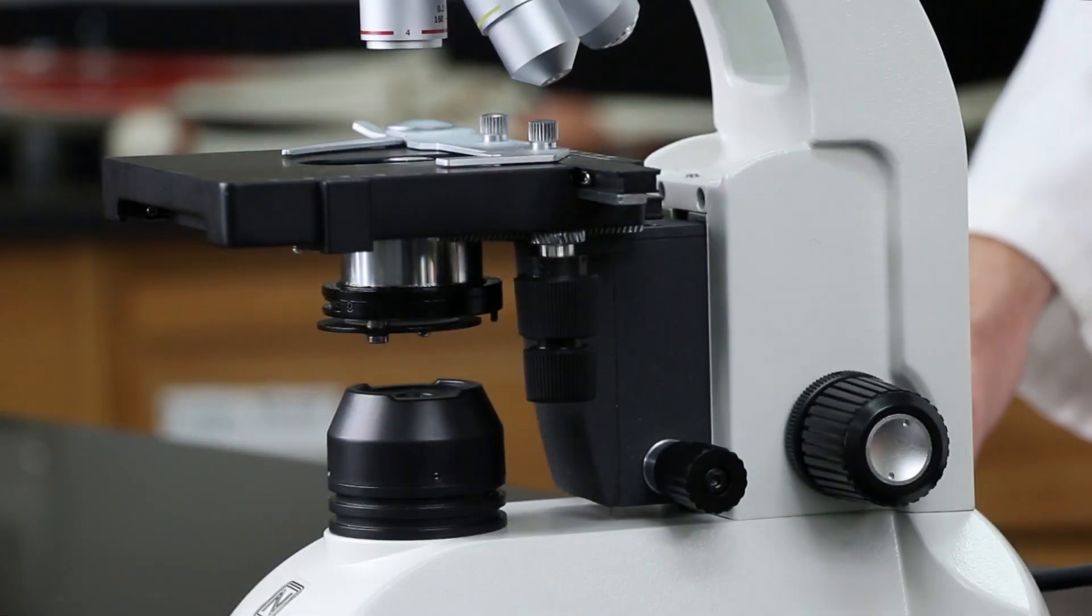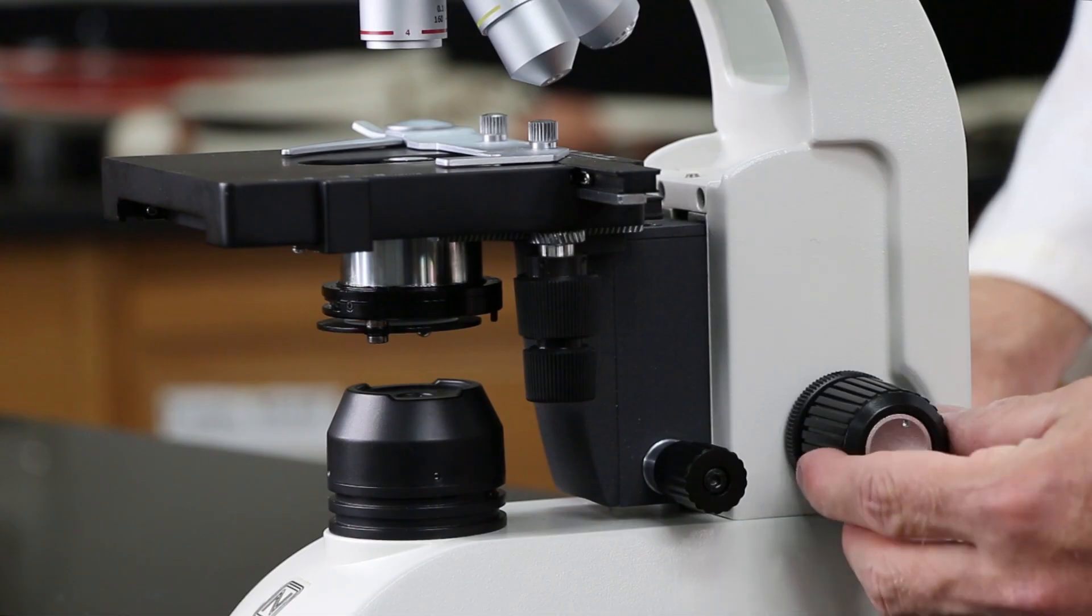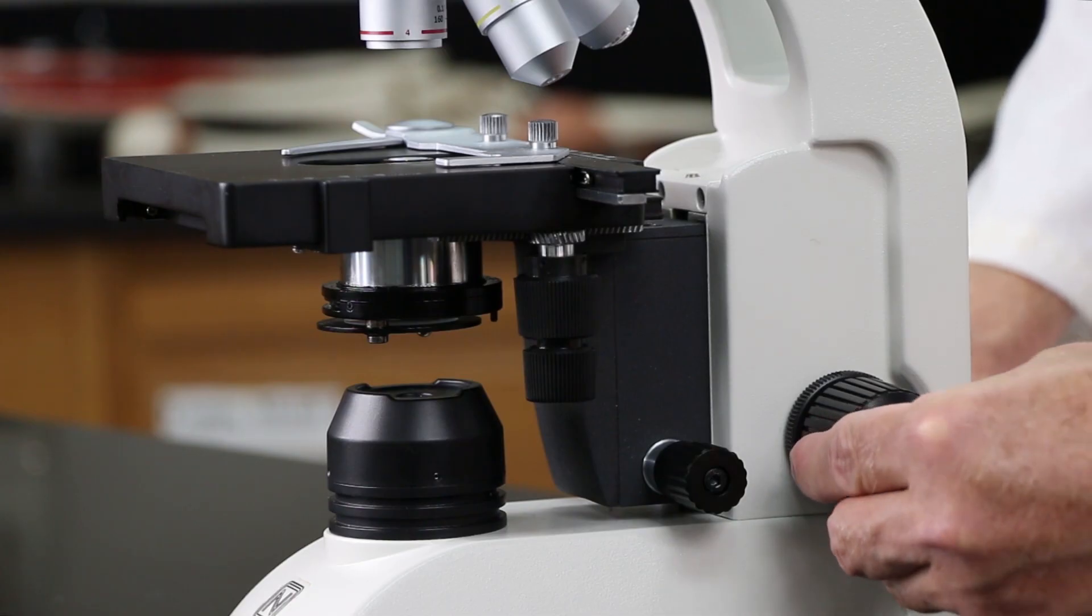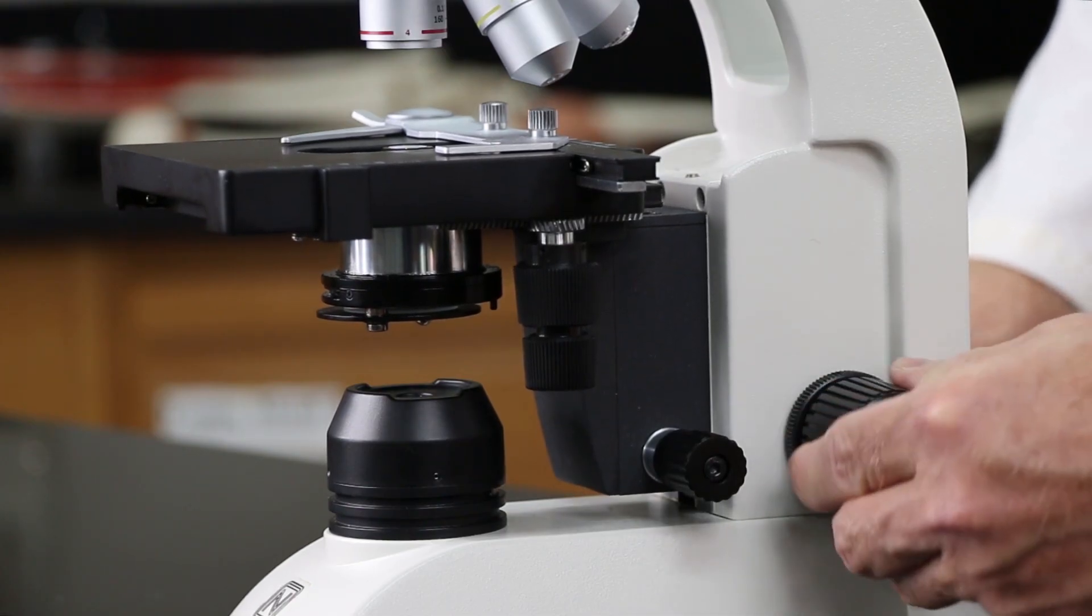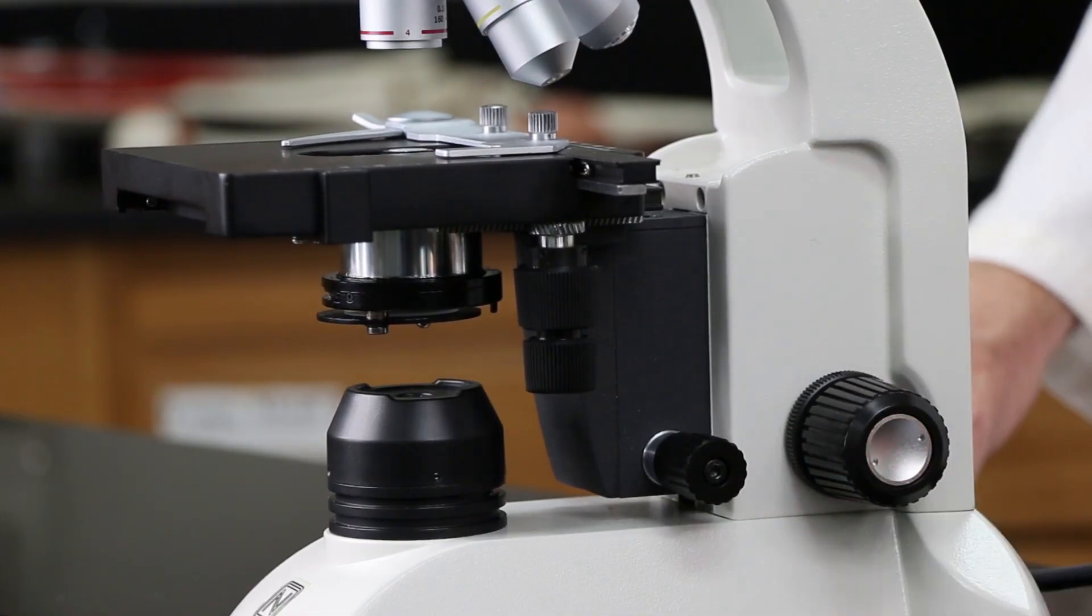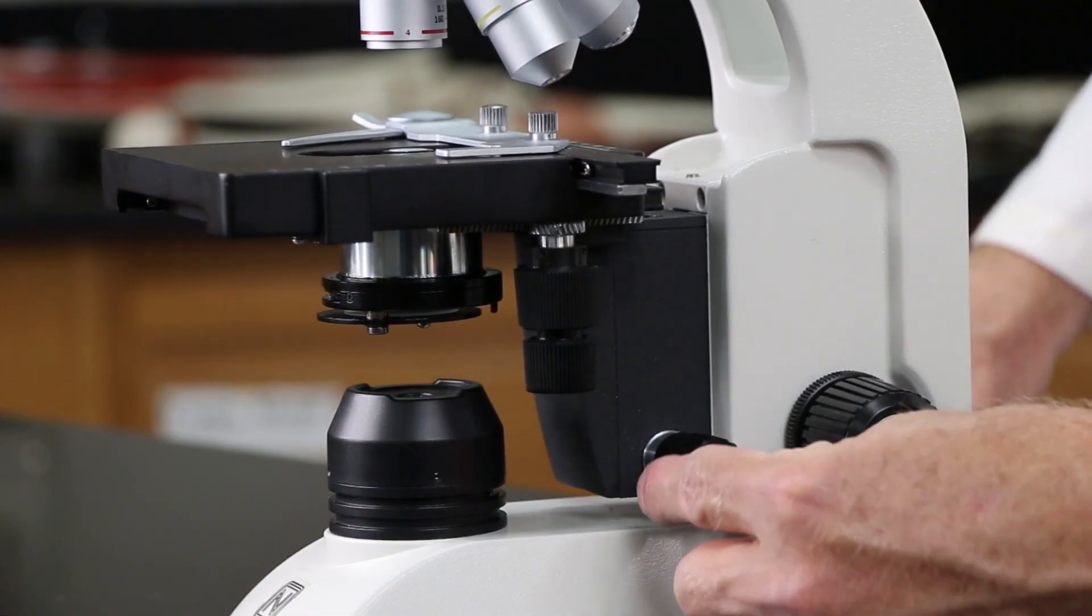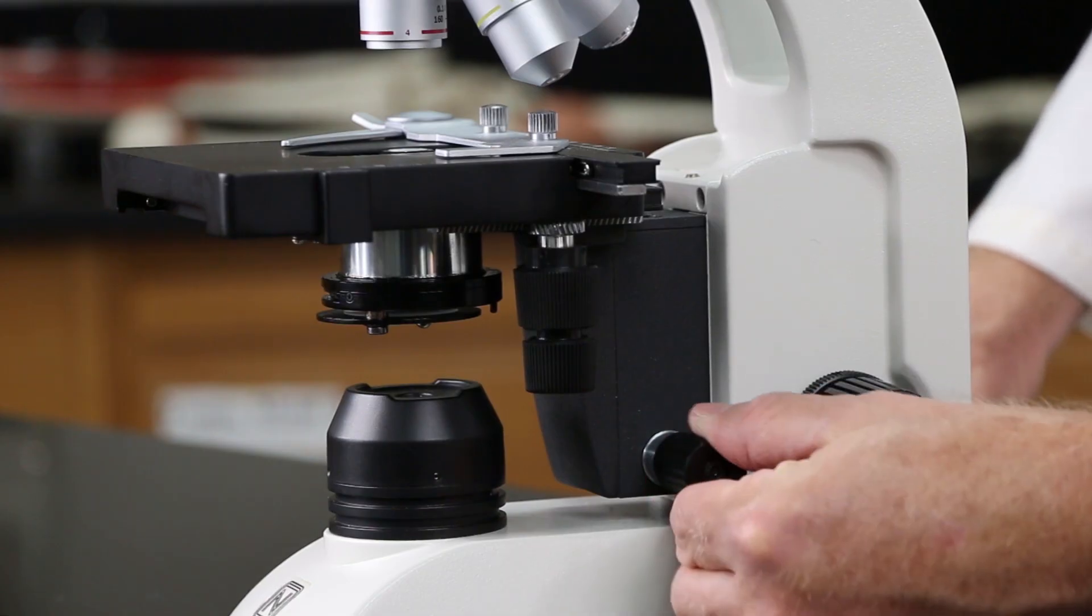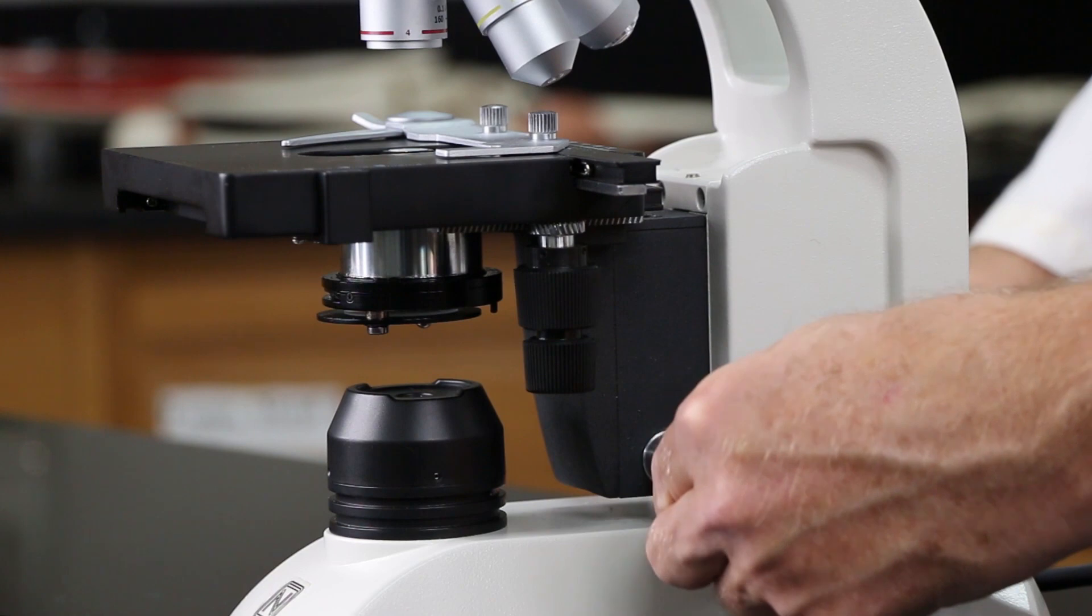These are the two focusing knobs. This large knob right over here is the coarse focus adjustment. And when I turn this, it moves the stage a lot. Now, right in front of it is a smaller knob, that's the fine focus adjustment. I turn that, it moves the stage a little.